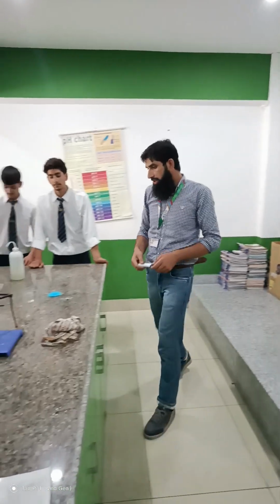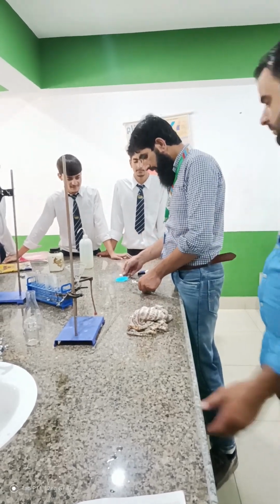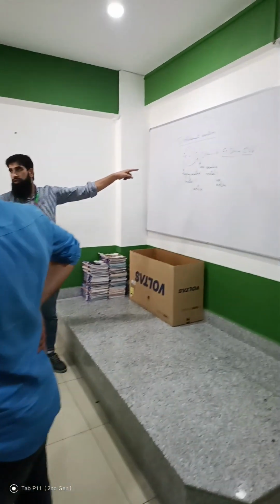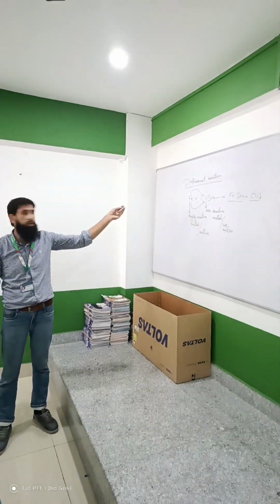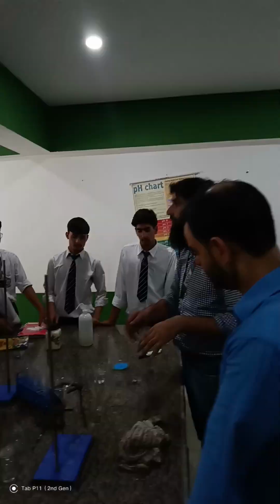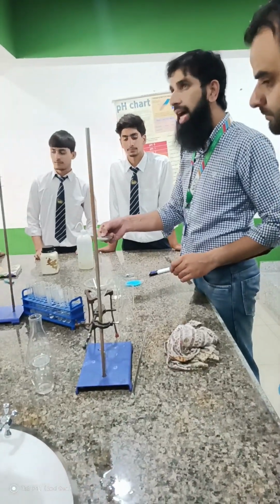This chemical is copper sulphate. Look at its color. This is copper sulphate. This is the metal, zinc metal. You can use it in the displacement reaction. We can use zinc, because zinc is more active than copper, and iron is also more active than copper. You can use zinc or you can use iron. We will use both the metals in the reactions. This is iron granules, zinc granules, and this black powder is iron.